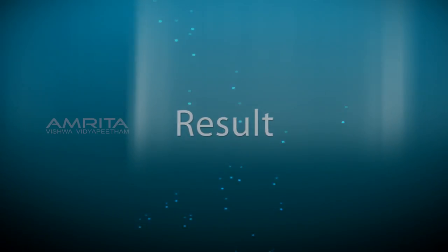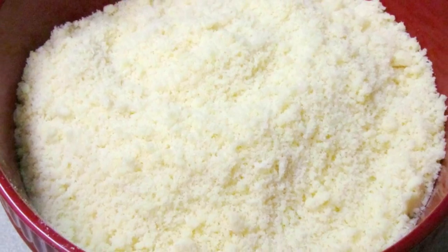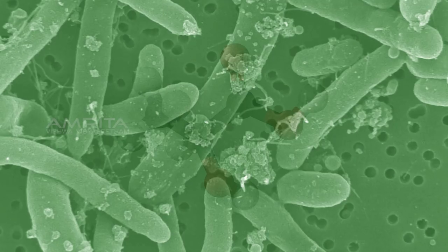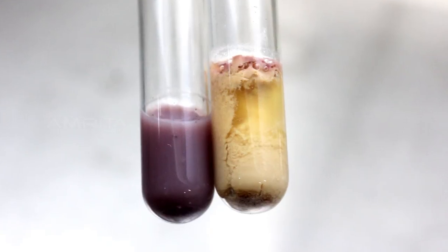Result: Escherichia coli convert the milk sugar lactose into lactic acid with the help of enzyme beta galactosidase. The medium turns pink due to curd formation and gas formation.